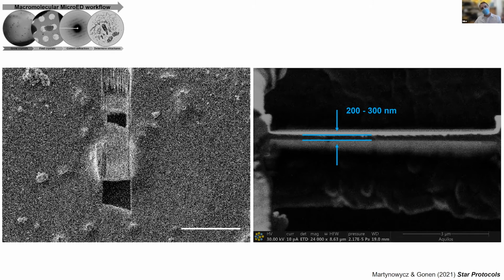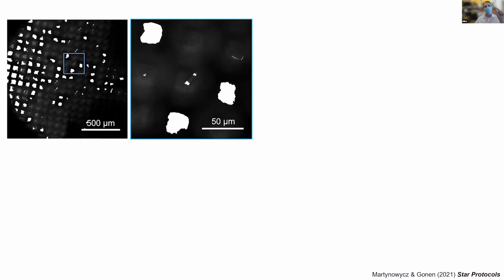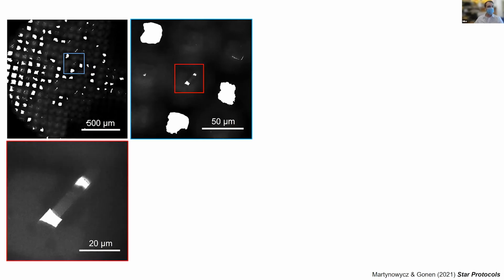We can transfer these lamellae, as we call them, into a cryogenically cooled transmission electron microscope, take an all-grid atlas from those dark grids we saw before, and we will see these wonderful thin strips of white material, with a tiny little piece hovering on it of the lamella we've made. So we can put on our CSI hats and zoom and enhance on what we've done here. And we can keep looking closer and closer.